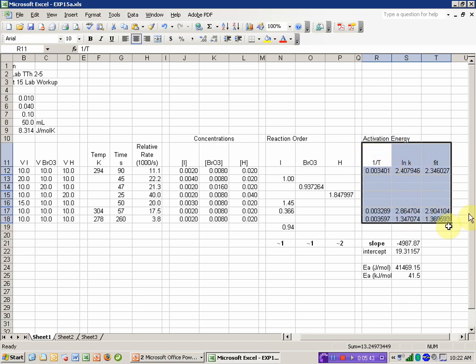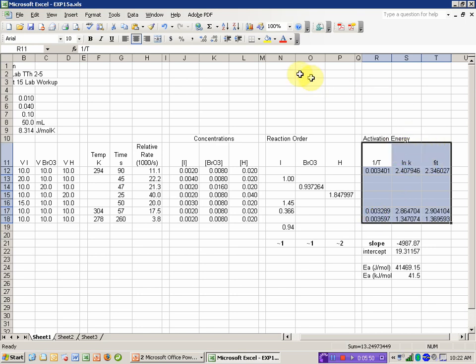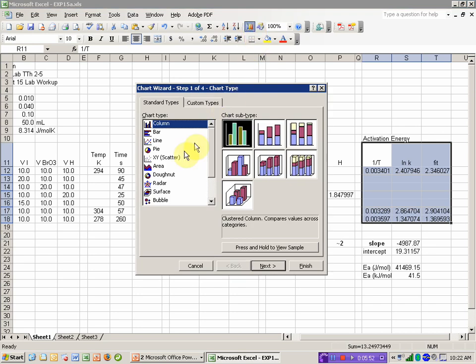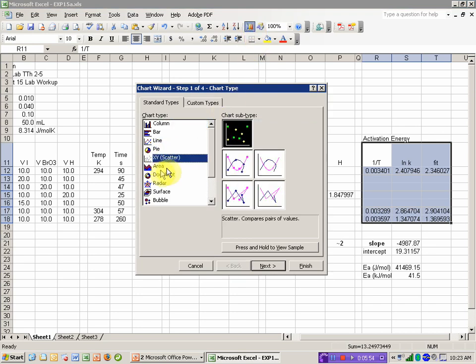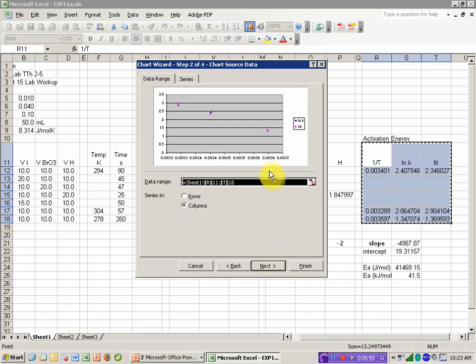If I go over this whole range, if I give the Excel plot function a large range like this, it will treat the first column as x data and the subsequent columns as multiple series. And that's what I want in my plot here. x, y scatter, you always want to pick the x, y scatter. And I'll start with just the dots.